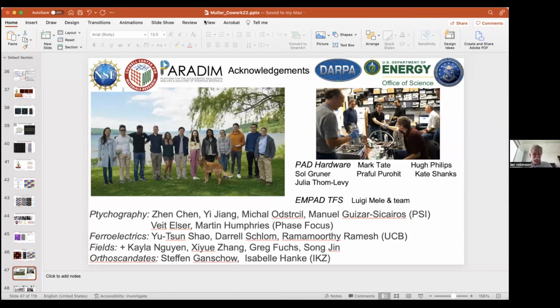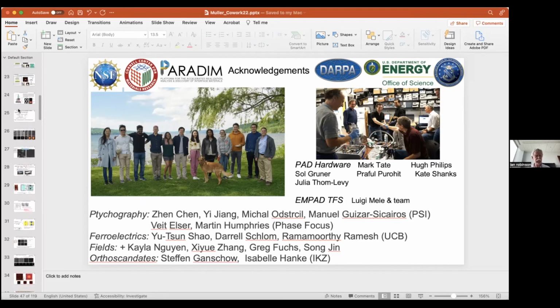I'm really, really impressed. This is quite splendid, for all the reasons I think everybody can appreciate, that's working at 10 times worse resolution with X-rays. So I was going to ask about the coherence, because that is a big deal, and it's something which I thought was limiting the ability, because of basically the ability to make a small enough source of electrons. But I'm curious, you said you've solved that by using Pierre's multi-mode methods, and I guess Manuel has helped with that. But what do the modes actually look like that you get out of the image?